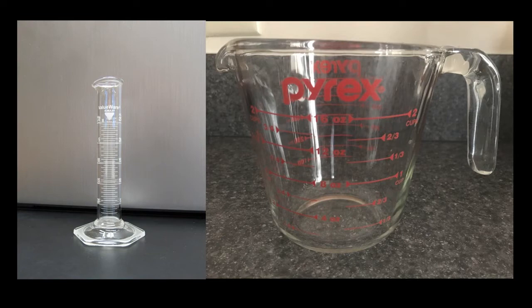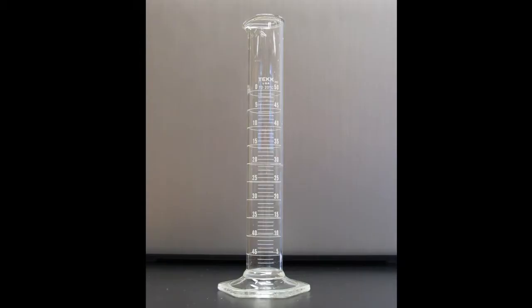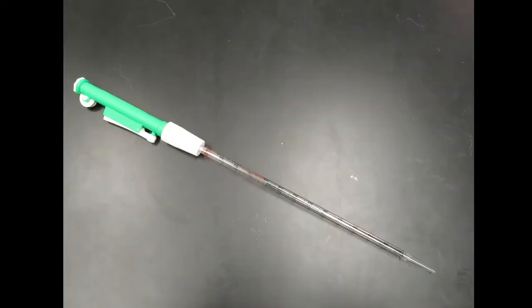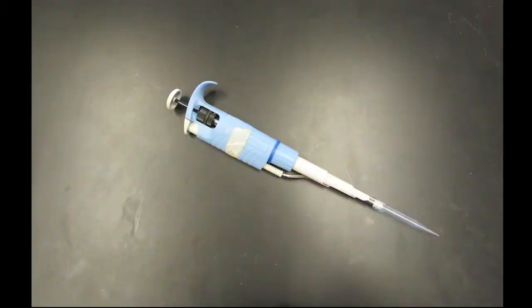A graduated cylinder is like a measuring cup that is optimized for use in a lab. Graduated cylinders are best for measuring volumes between 25 mL and 2000 mL. If you need to measure between 1 and 25 mL, use a pipette. If you need to measure less than 1 mL, use a micropipette.